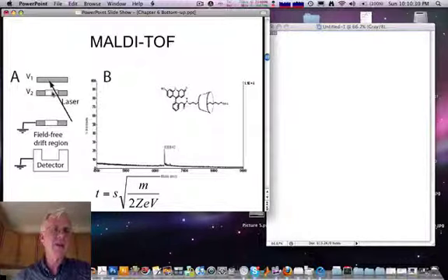After the ions have been accelerated, they drift in a field-free region so that ions with higher velocity will cross it faster and then fall into a detector. The plot then is a count of the number of ions hitting the detector as a function of drift time. This can be calibrated. One has the problem that one doesn't know whether the molecules are singly, doubly, or triply ionized, but that can be easily sorted out because of the integer relationship between where peaks occur.